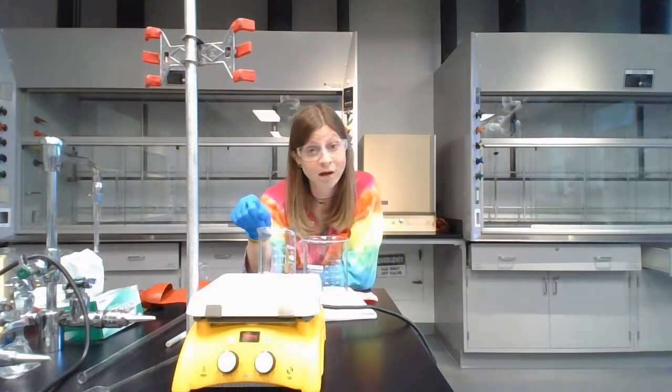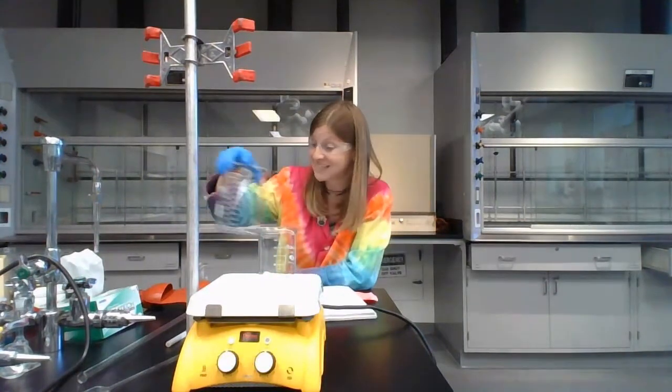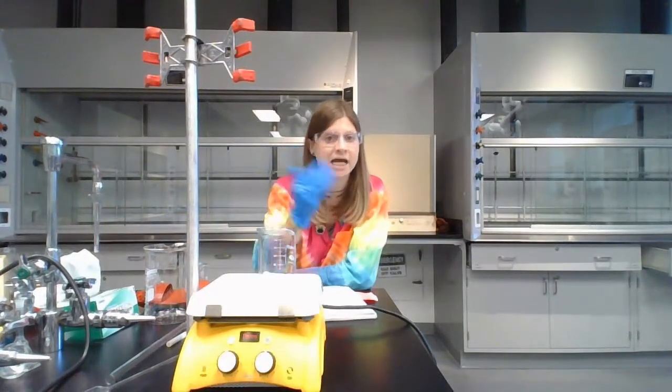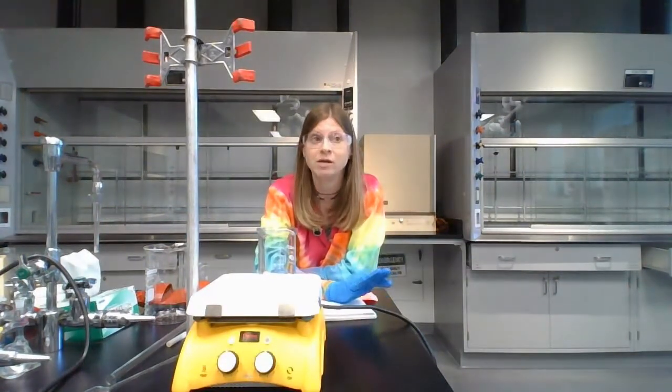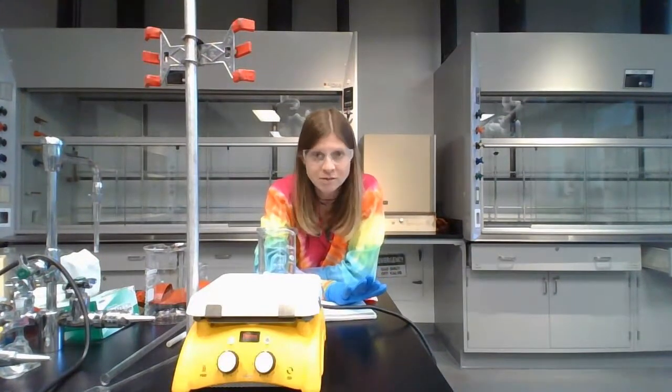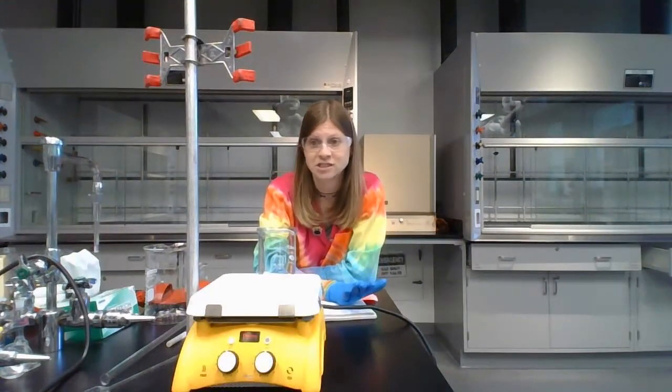And don't crank it all the way up, because again, we do not want this to boil. We want it to get to 70. 70 is the ideal temperature for this, but it can be between 70 and 90 for this to work. Be careful about keeping your two waste beakers separate, and ask your instructor if you have any questions about this as you're doing it, especially safety related things.